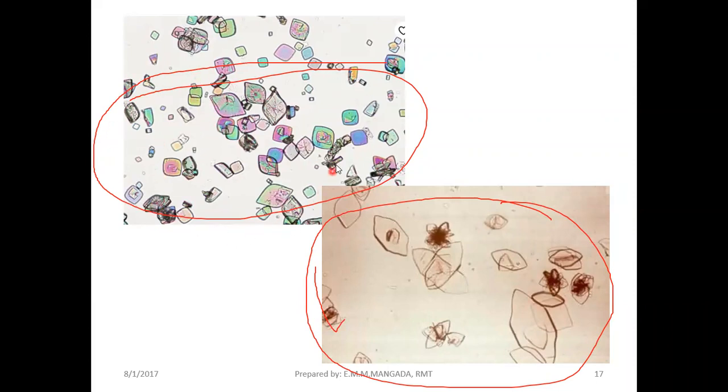So this one is a picture taken under your polarizing microscope. We appreciate the details of our crystals more compared to when using the bright field. So again, these pictures are a view under your polarizing microscope, and this one is under your bright field microscope.